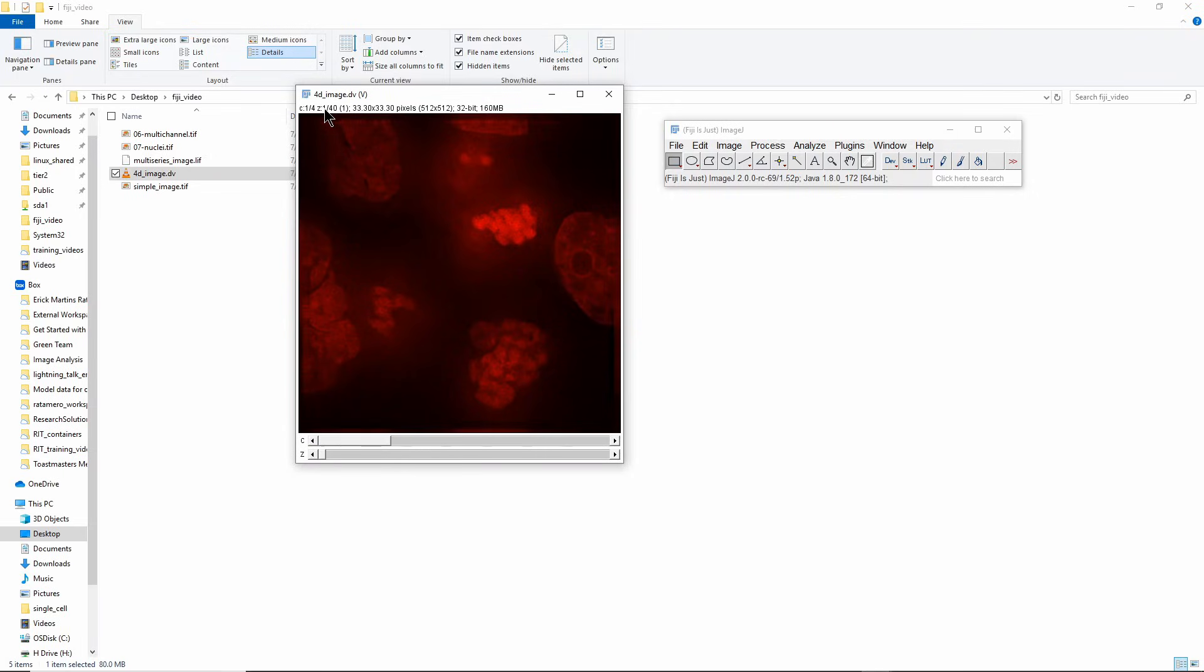It has 40 different z slices. So this is essentially a 4D image, that's why it has that name. It has two dimensions that are being shown here, plus channels, plus z slices.